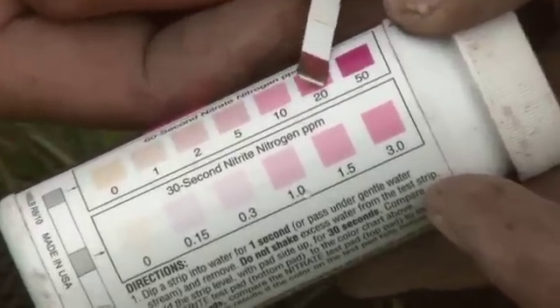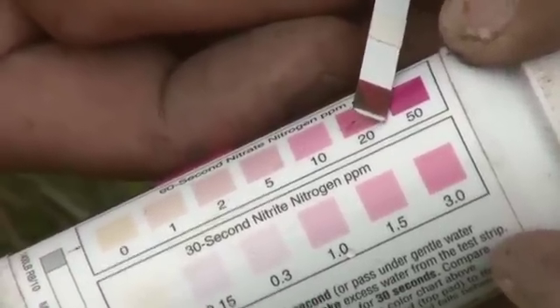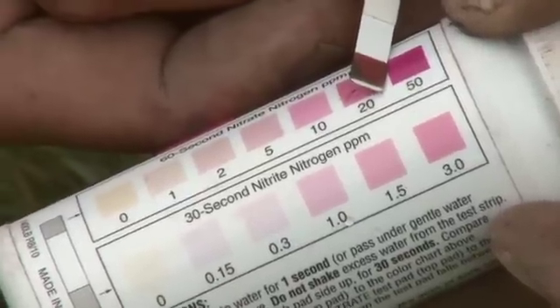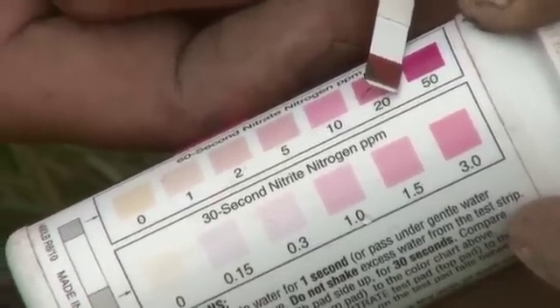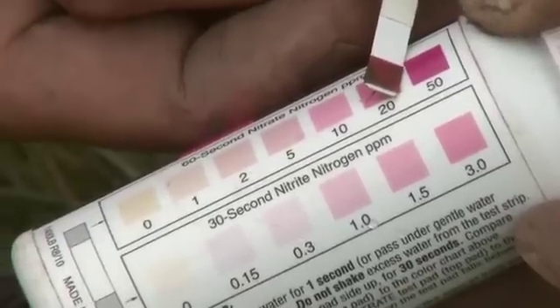What we have for a color is somewhere between 20 parts per million and 50 parts per million. In this example, I would say it's probably closer to 50, so about 40 parts per million. Then you go ahead and record that in your educator guide.